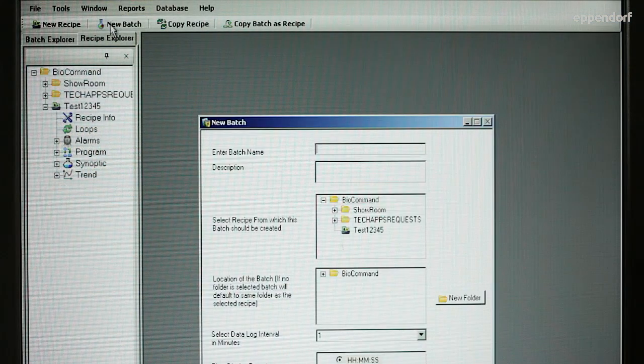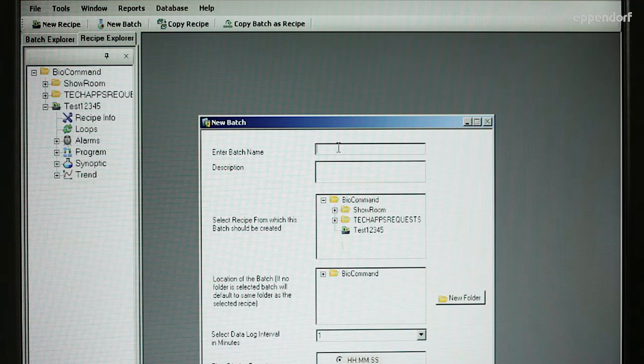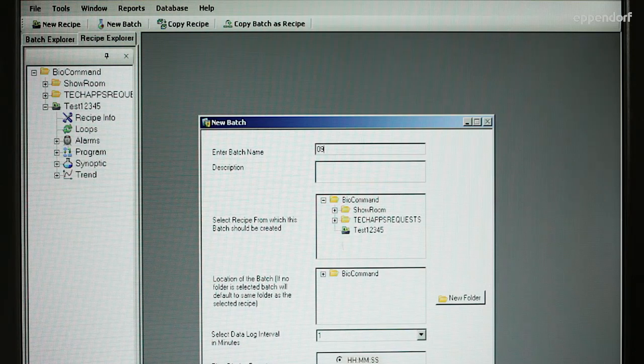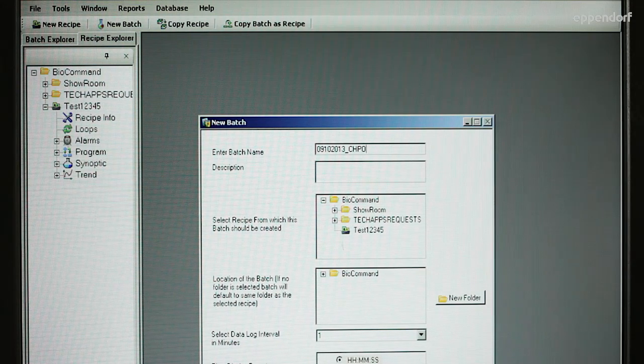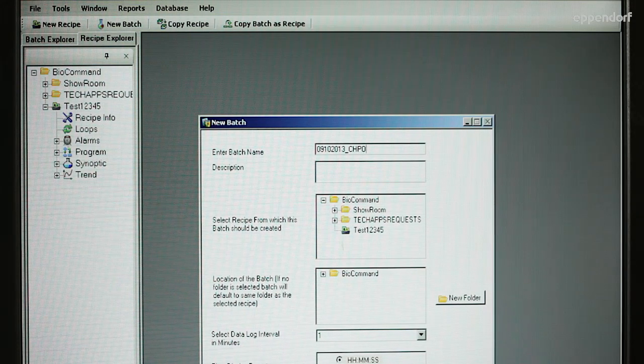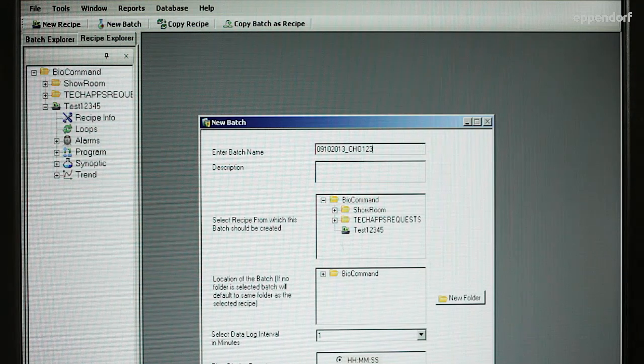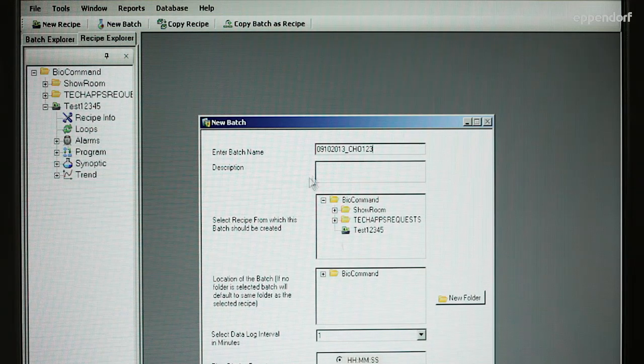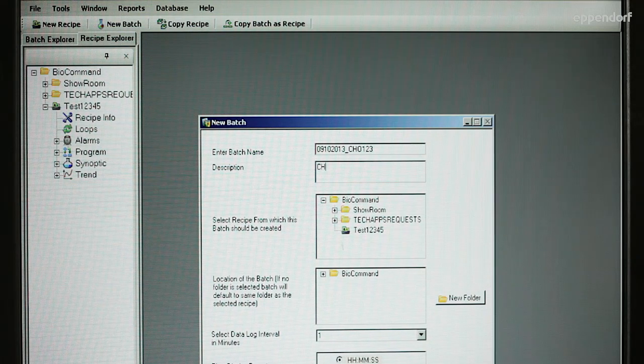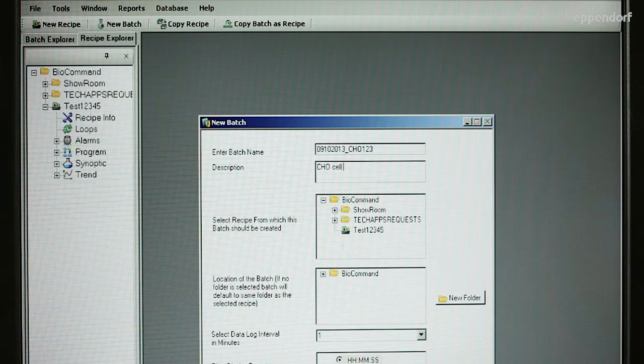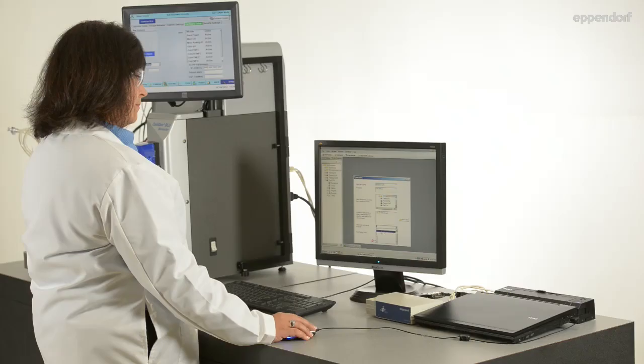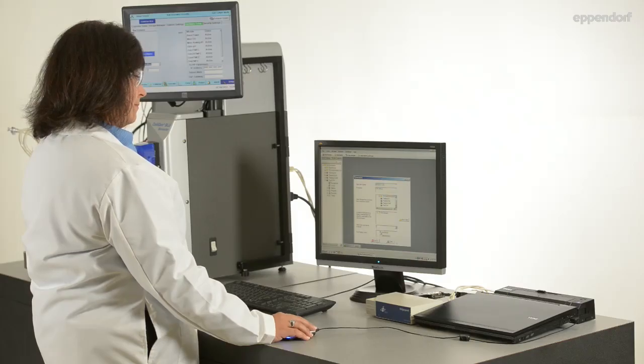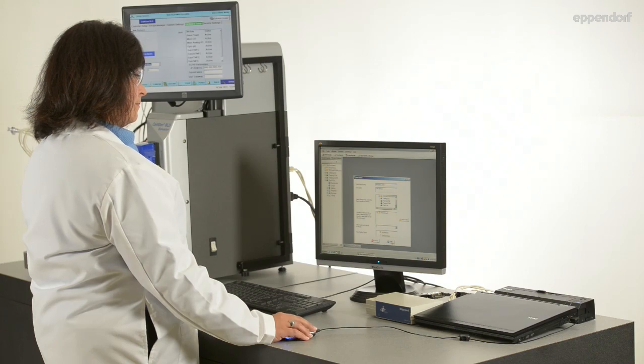Click on the New Batch button to start creating a batch. When the New Batch window opens, enter a batch name and description. Then select the recipe, a location for the batch to save, data log interval, and time display format. When all of the required information is provided, click Start Batch.